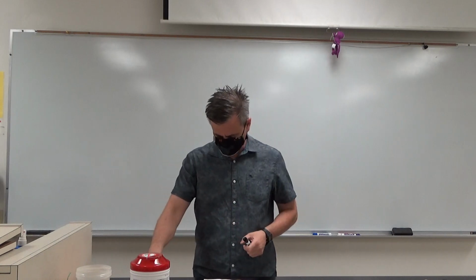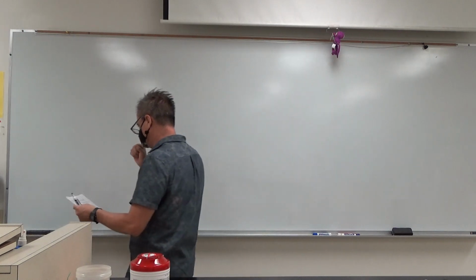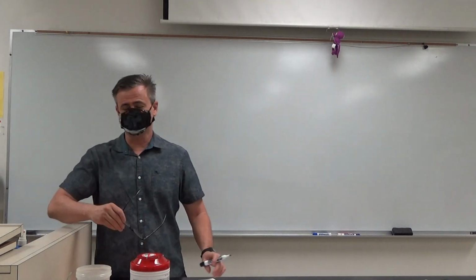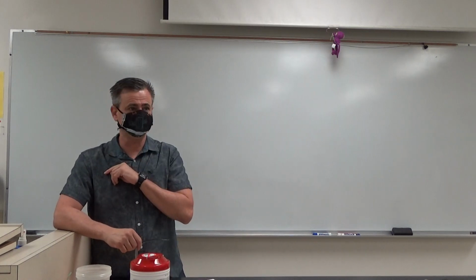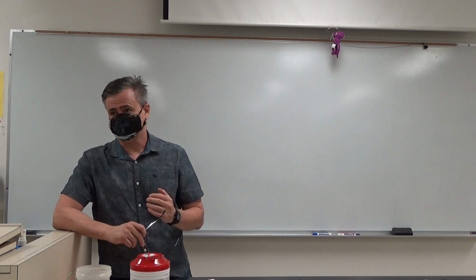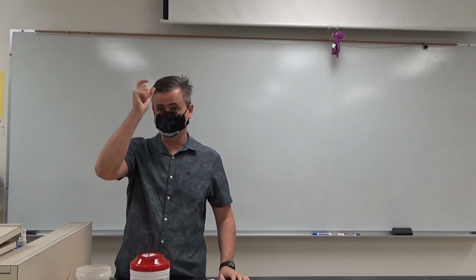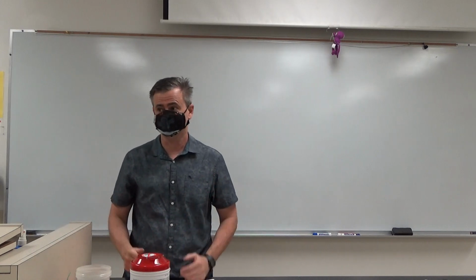Okay. All right. Let's remind ourselves what the reactions were that we did. Couple announcements. So you're going to take 10 microliters, an incredibly small amount of your product, okay, and then you're going to prepare it for the GCMS upstairs. GCMS is extremely sensitive, so it hardly takes anything. But after you take out your 10 microliters, don't throw the rest away, okay? I'd like to save that in case somebody else spills theirs or something like that. So, make sense?